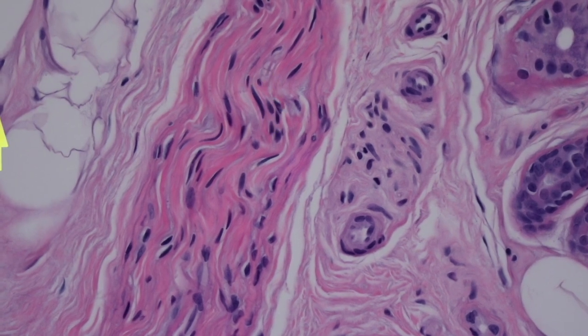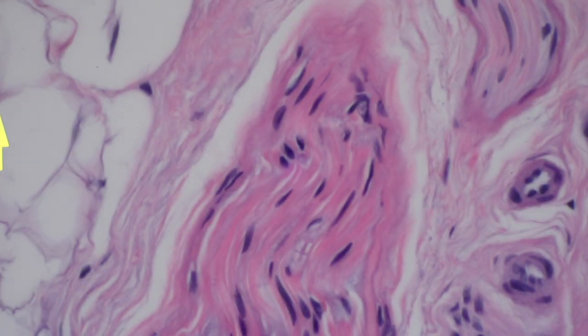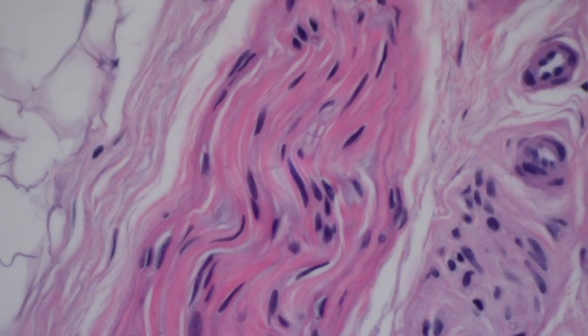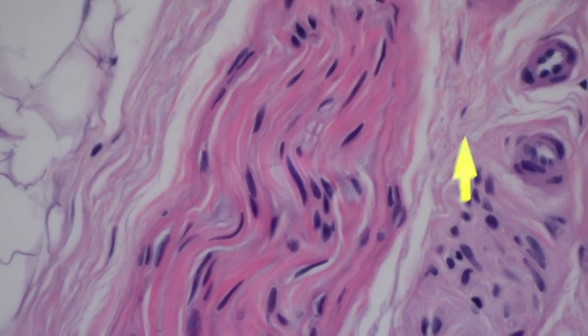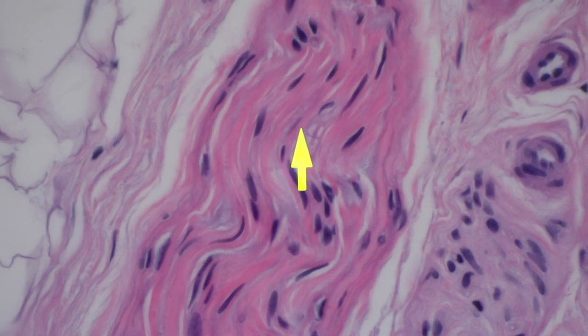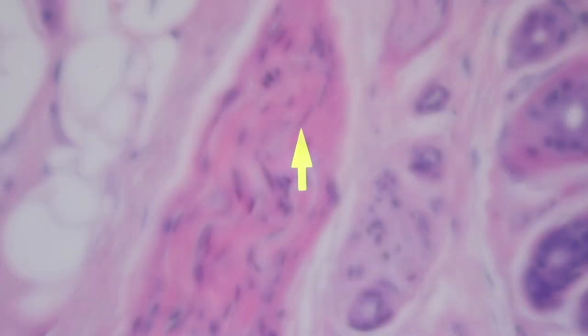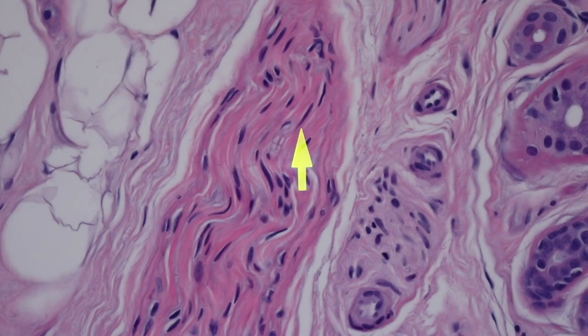Those little bubbles around the axon are where the myelin normally resides. That little pink line is the axon, and that white space is where myelin was — it's now washed out. Only in larger, deeper nerves do you really see much myelin. Up near the surface of the skin we don't usually see myelinated nerves; we only see unmyelinated nerves most of the time microscopically.